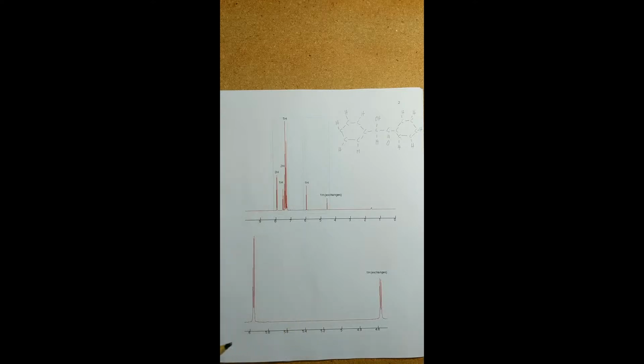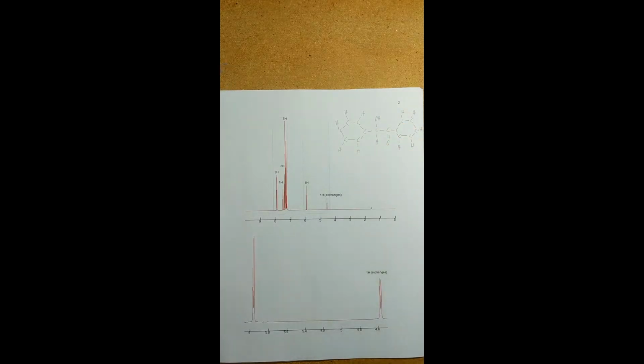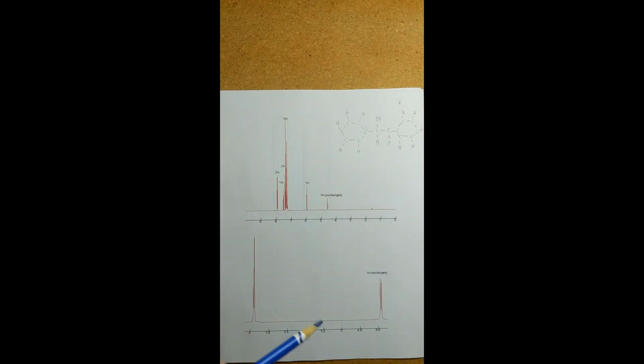So the first thing that I actually want to do is label the peaks as whether they are a singlet, doublet, triplet, etc. And so I'm going to go ahead and do that for you now. Both of these sections can be expanded. As you can see on the bottom, this is the expanded view, and bringing this expansion is this top sheet right here.